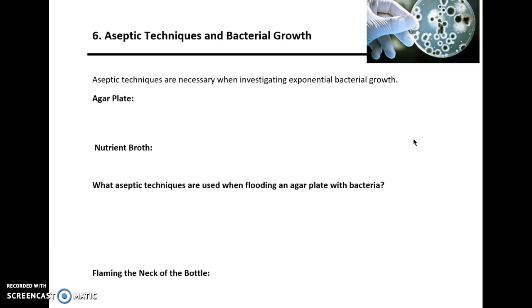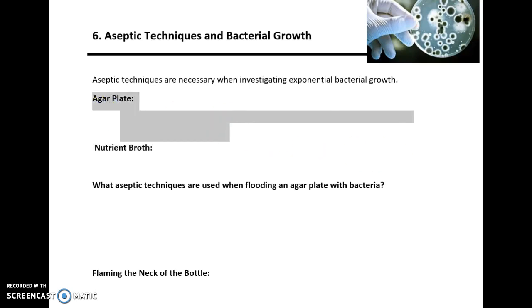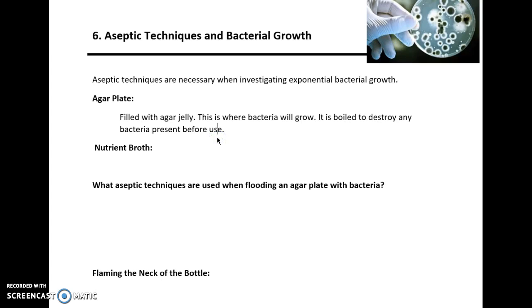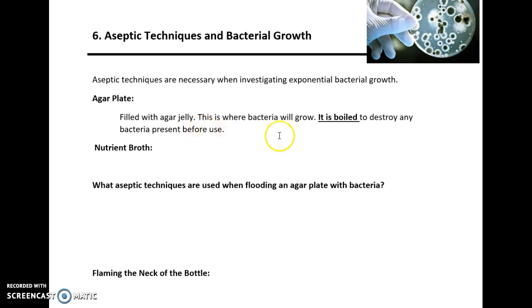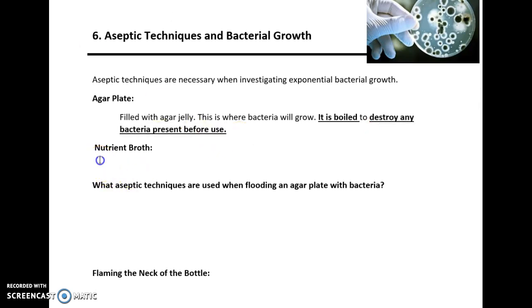There are many important aseptic techniques that are needed when working with bacteria. The first thing that we use is the agar plate, which is filled with agar jelly — that is the conditions in which the bacteria will grow. Before we use the agar plate, we boil it. The main reason why it's boiled — and the reason that will get you the mark — is that it's boiled to destroy any bacteria that might be in the plate before using it.